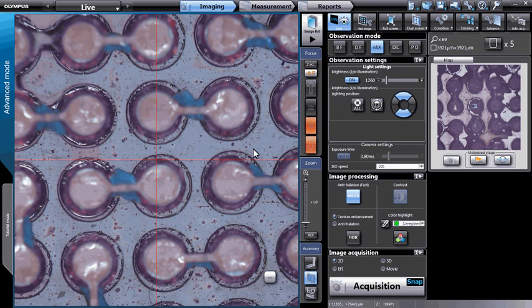Advanced acquisition functionality is available on the DSX series opto-digital microscopes that are equipped with a motorized stage. This function will allow the user to define an origin point on a sample, then provide 2 points to deskew or correct for any rotation of the part on the stage. Once this is accomplished, a set list of inspection points can be loaded, and the system can be programmed to visit these points and perform a predefined image acquisition.